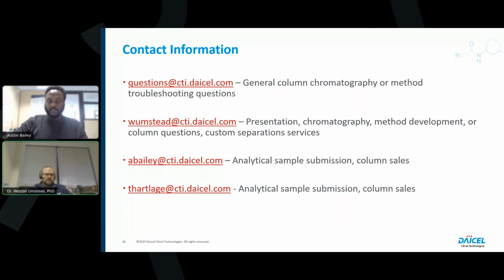However, because of the access to extended range solvents, we oftentimes can find better separations by incorporating some of those restricted solvents and redeveloping the method on IA, as an example here going from ADH to IA. So yes, there are differences. Usually it's a slight decrease in the selectivity, but we have ways to modify it to actually improve over what you might be seeing with ADH.